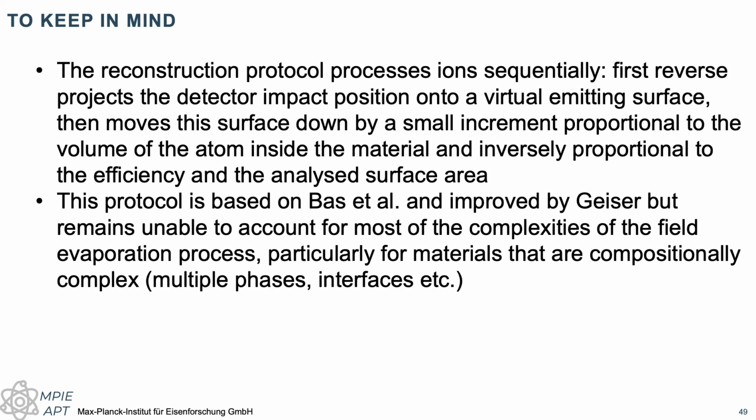This protocol, which was proposed by Bas et al., builds on the works from Blavette in the early 1980s. It was improved slightly by Geiser, especially for the shank angle reconstruction, but it still doesn't really allow us to account for the very complex shapes that the field evaporation provides to the tips, and the field emitting surface that is really not a spherical cap. And this becomes particularly problematic for materials that are compositionally complex, with multiple phases, interfaces, and so on and so forth, which are basically our bread and butter. So we just need to be a bit careful.